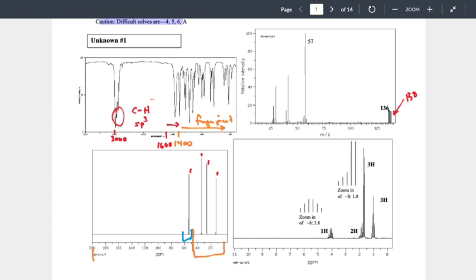So what Josh suggested is that maybe that one is our carbon connected to the bromine, because I suspect I have bromine based off of my other data. That could explain why that carbon is sliding just outside of the alkane range, because it's close to an electronegative element. That analysis is great. I would argue it's kind of a step beyond what is necessary for me. I would just call it 1 times x. I don't know what it is.